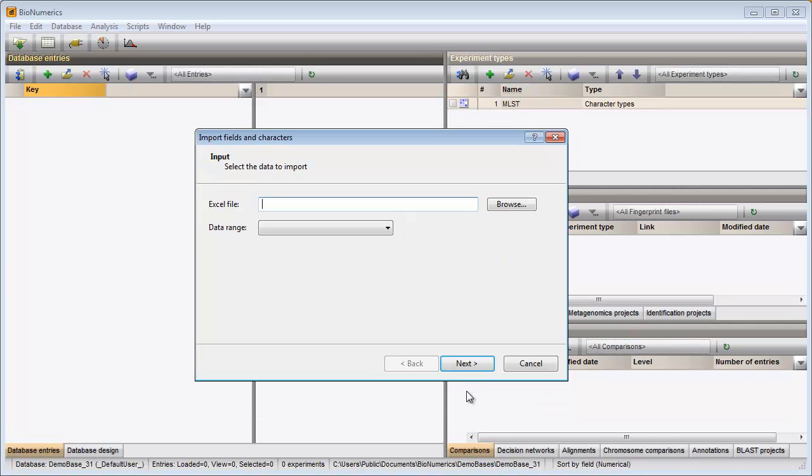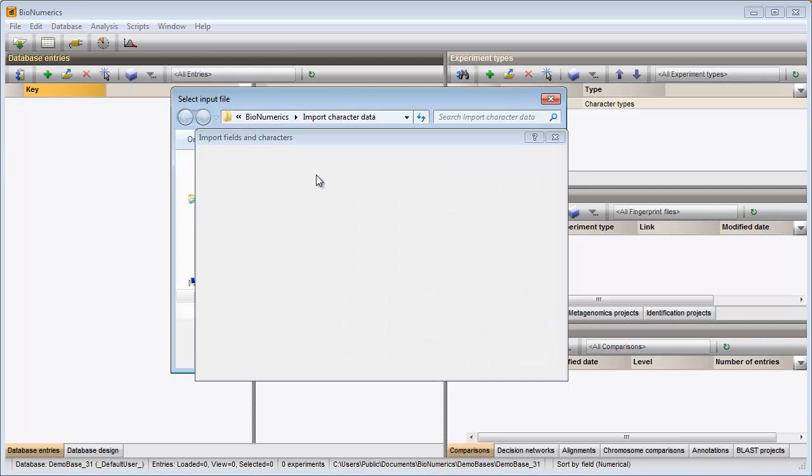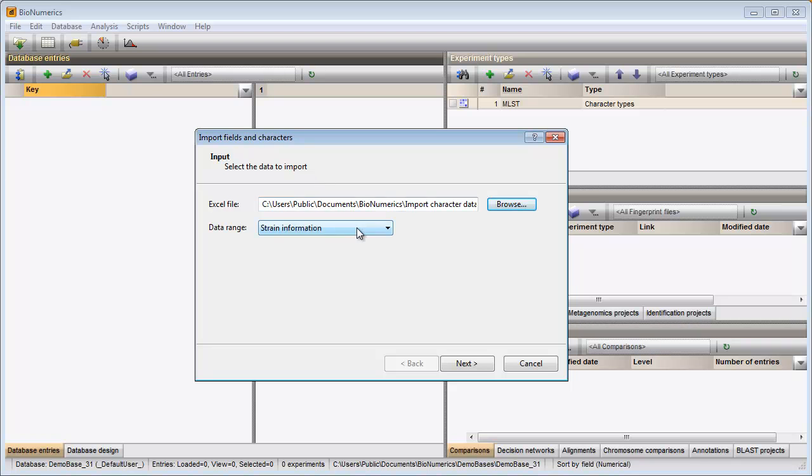When I click on Import, I need to select my Excel file in the next step.